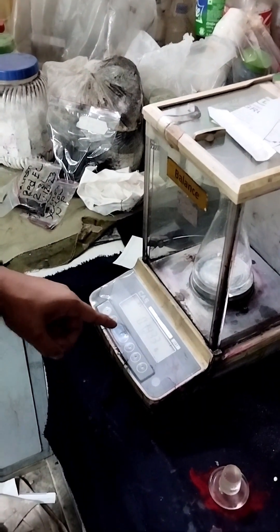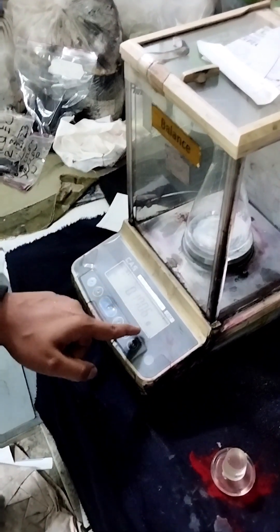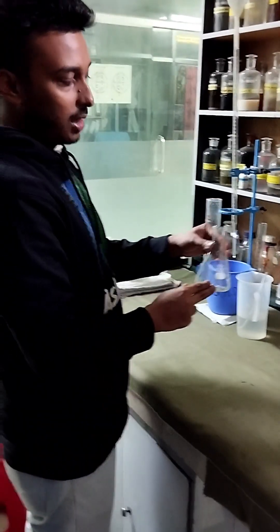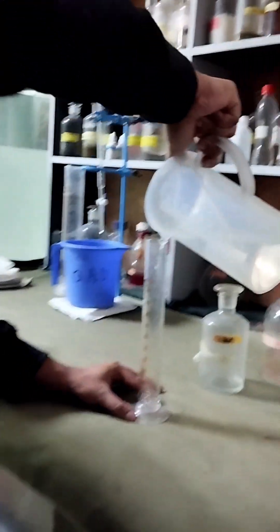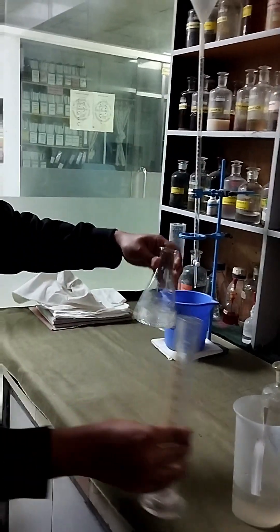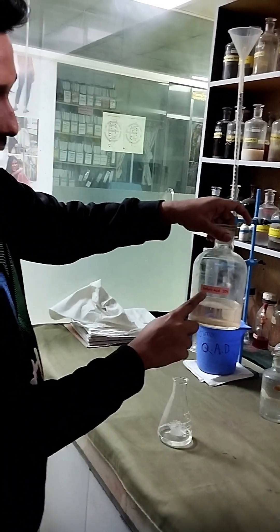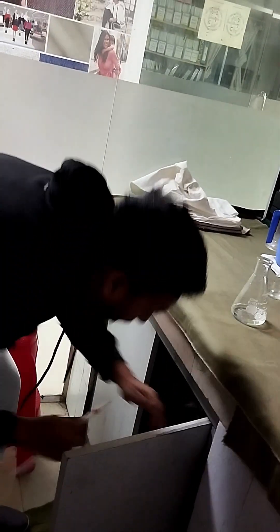Here is the weight — I have taken 0.1707 gram, approximately 0.1706 gram. Then we have to add 50 ml of water. After that, we will add the indicator: 20% sulphuric acid. Here is the sulphuric acid 20%, and we need 5 ml of it.